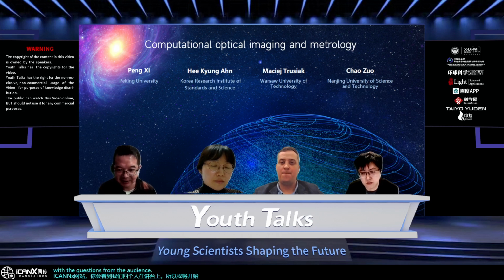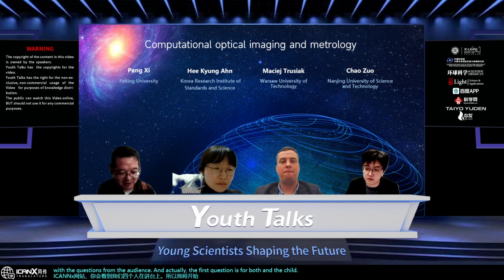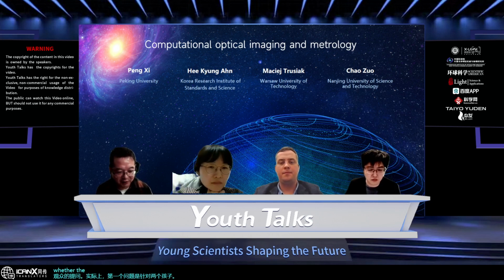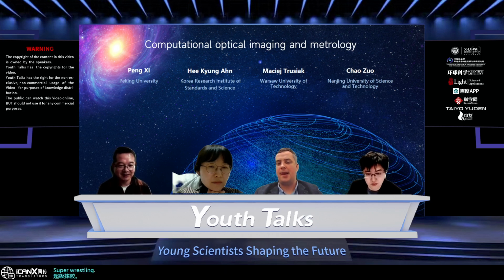The first question is for both Anne and Chao: whether label-free phase microscopy can break the diffraction limit and reach super resolution. Anne, you go first.